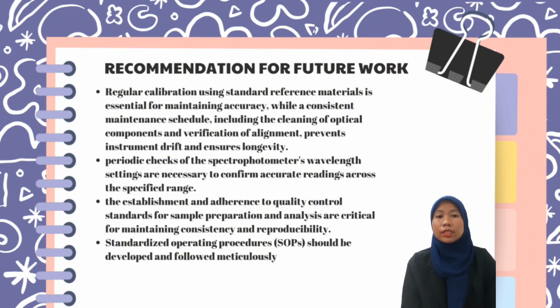Besides that, periodic checks of the spectrophotometer's wavelength settings are necessary to confirm accurate readings across the specified range. Other than that, the establishment and adherence to quality control standards for sample preparation and analysis are critical for maintaining consistency and reproducibility. Lastly, standardized operating procedures should be developed and followed meticulously.